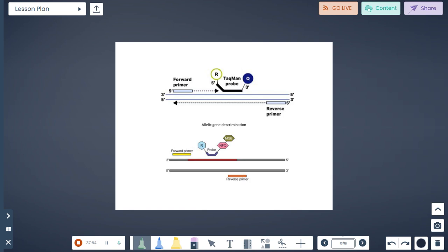So this forward primer and reverse primer you have seen earlier. This is a normal forward primer and reverse primer generally people will use. In between, suppose you want to quantitate the PCR product formed, you can add one probe that is called a TaqMan probe. At the 3' end there is a quencher, and at the 5' end there is a fluorescent compound, which is a conjugated primer.